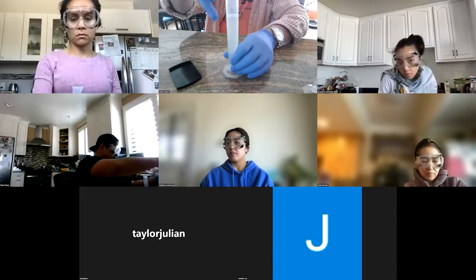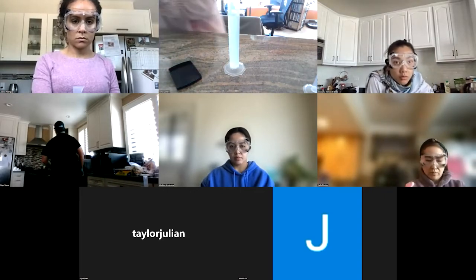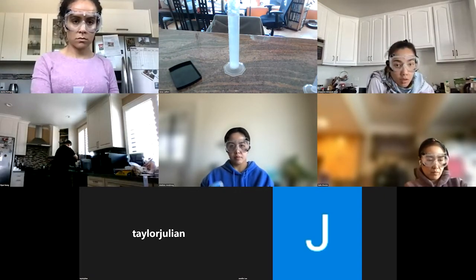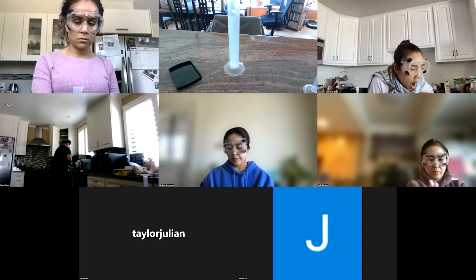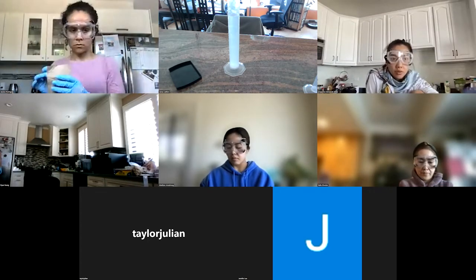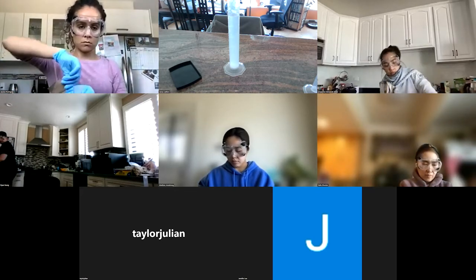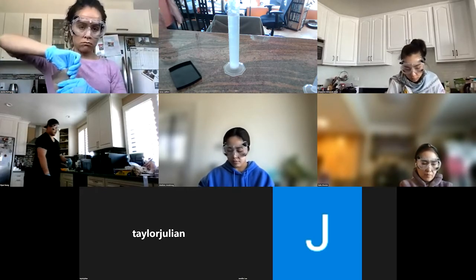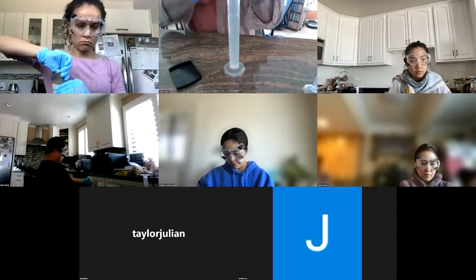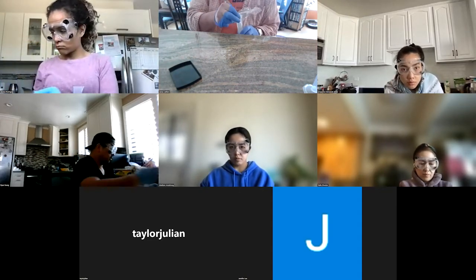So this you're going to want to cover with your gloved hand too, or you just take some saran wrap and put it over the top. I think I'll do that. Yes, put saran wrap over the top of it so you make less of a mess.